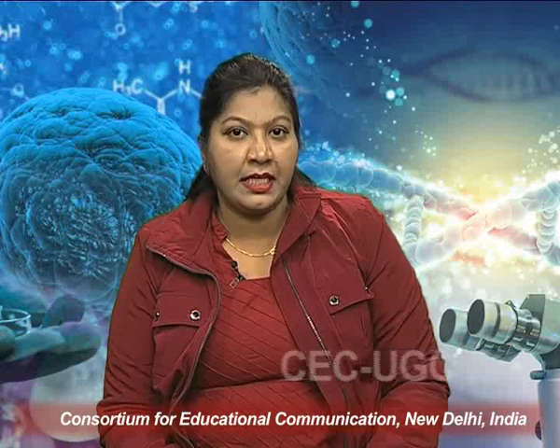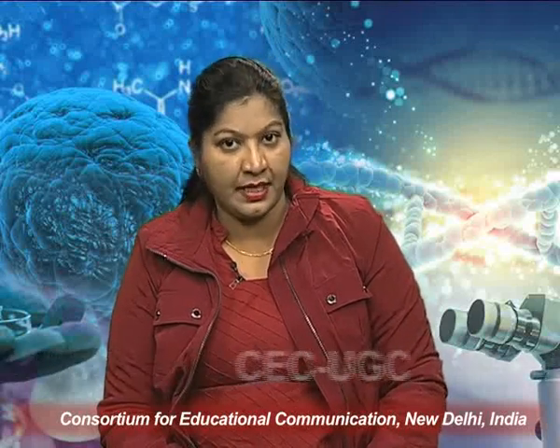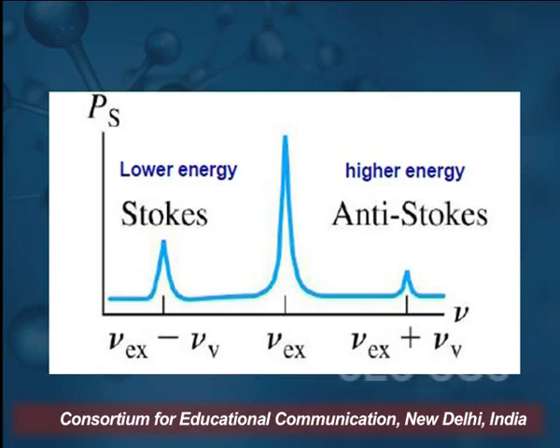As we discussed in the previous lecture, Raman scattering takes place at a frequency other than that of the incident frequency. It may be increased or it may be decreased. When it is decreased, it is a Stokes line. When it is increased, it is an anti-Stokes line. On the diagram we see a graph between intensity versus frequency. The Stokes lines have the lower energy state and the anti-Stokes lines the higher energy state. The frequency in the Stokes line is less, and in the anti-Stokes line it is more, as compared to the incident frequency.